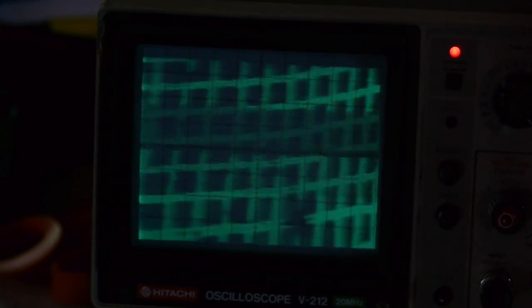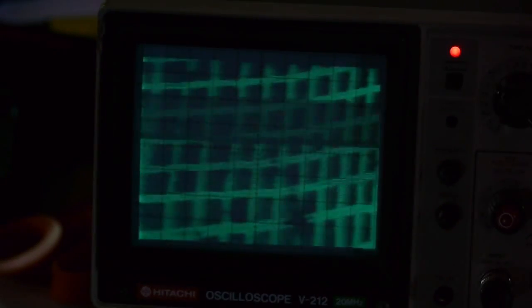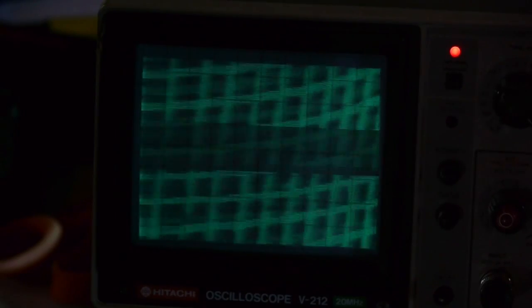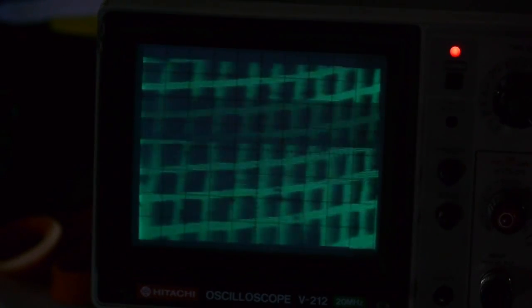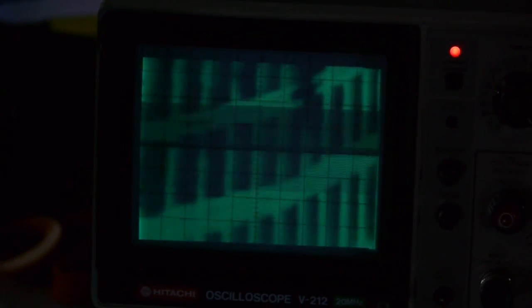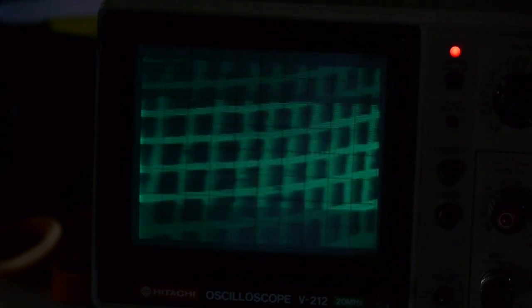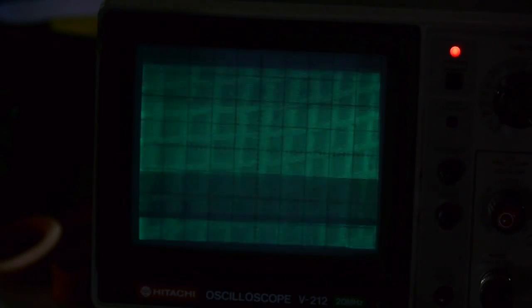And there's our metal mesh screen. So the controls on the oscilloscope I don't really need to use, I'm just going to turn the dials on the front of the microscope to change the scan pattern. You can actually move around in space inside there and get a different view of the screen. The screen itself is a really good target because it has the same pattern all over the place. So no matter where the scan hits the sample, we're bound to get a nice pattern like this and it's also square so that you know if the image looks like this I'll know that the amplification in either axis doesn't match so I can adjust that so that we get a nice clean image. And then we can also try playing with the photo multiplier voltage to get a little bit of a better image. Maybe turn up the scintillator voltage a little and we can adjust the gain on the photo multiplier amplifier.